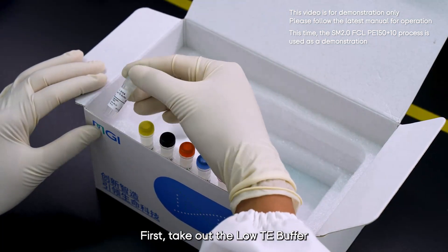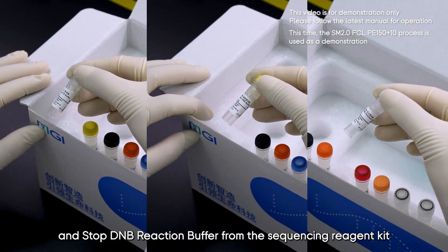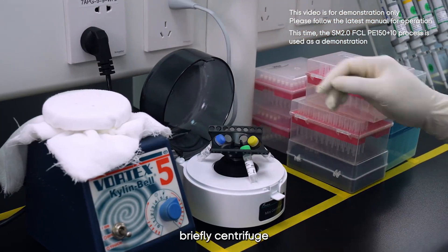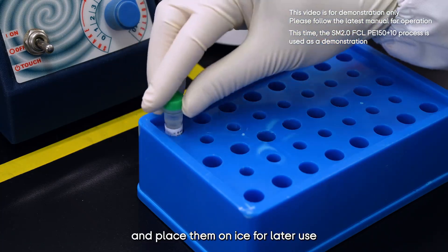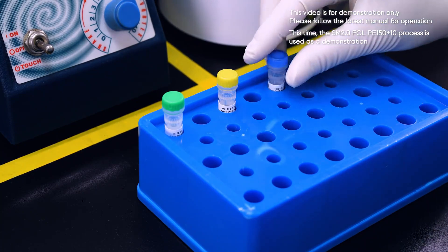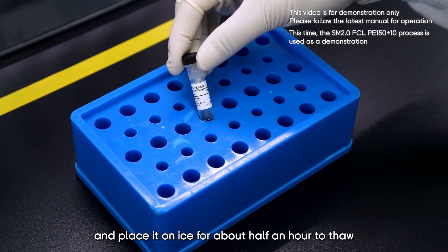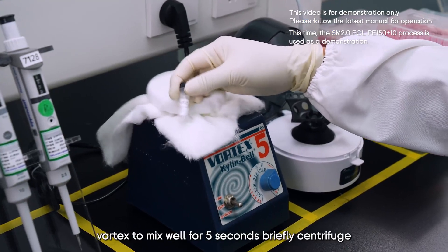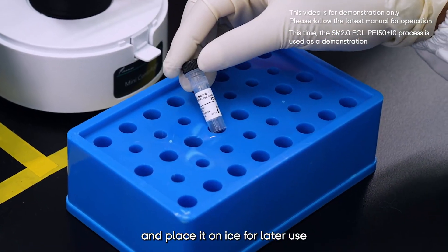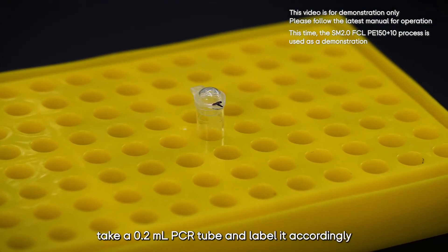After determining the input volume, proceed with DNB preparation. Take out the Low TE buffer, Make DNB buffer, and Stop DNB reaction buffer from the sequencing reagent kit. Thaw them at room temperature, vortex to mix well, briefly centrifuge, and place them on ice for later use. Next, take out the Make DNB Enzyme Mix 1 and place it on ice for about half an hour to thaw. Once thawed, vortex to mix well for five seconds, briefly centrifuge, and place on ice.